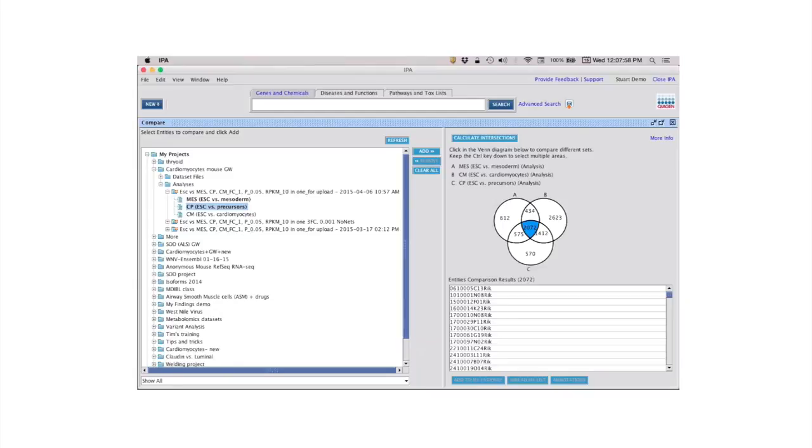Okay, yeah, so it is the second. Again, really you want to upload into IPA the already processed fold changes and p-values that you do upstream in some other tool. I can't really recommend any particular algorithm. That's sort of up to you, or look in the literature to see what the best one is. As in this example, I find it really easy to use the CLC Cancer Research Workbench software, and it has its own algorithm. I think it's EdgeR, I think. So yeah, I can't really recommend one or another at this point.